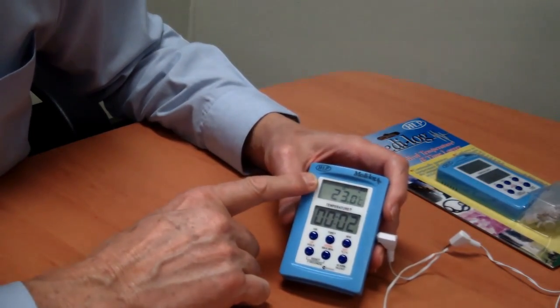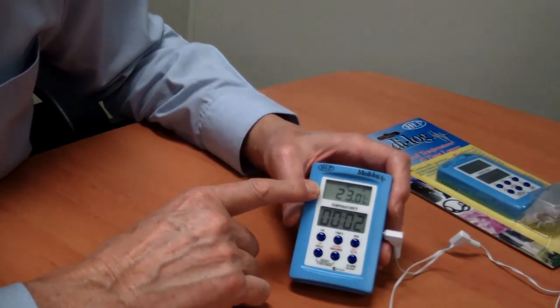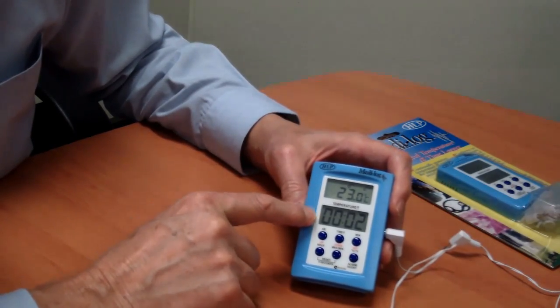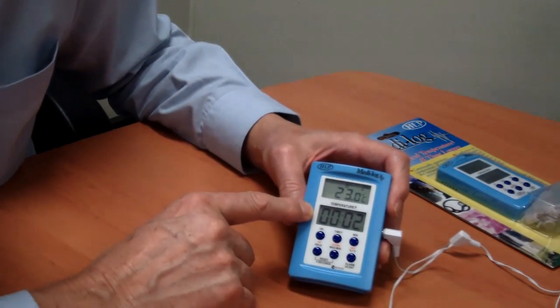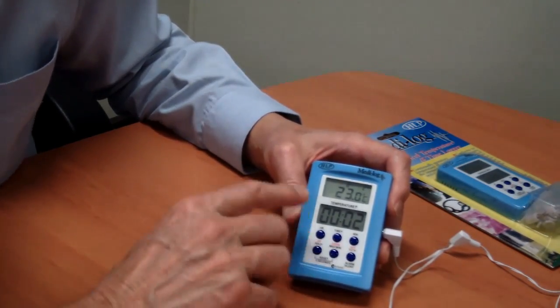So the beauty of this unit is that it has the preset alarms, the alarms are audible, and that shows you how long the alarm has been running or how long it's been out of temperature in hours and minutes, which is very good and it's everything that's required by the immunization people.